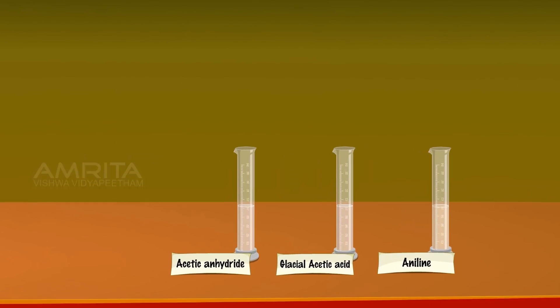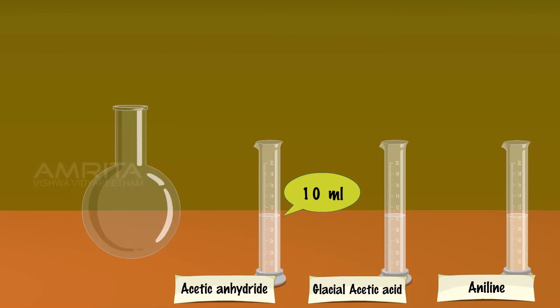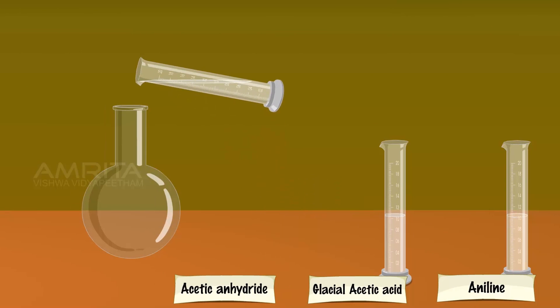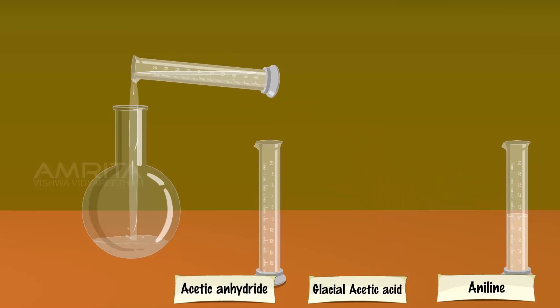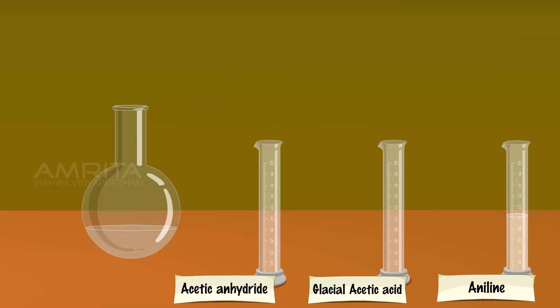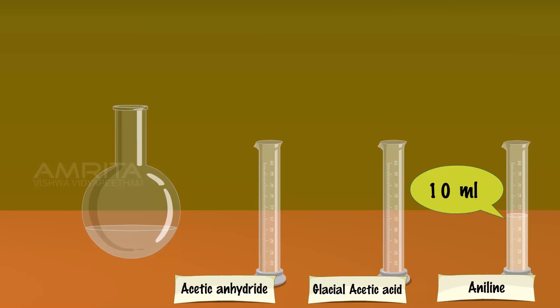In a 250 ml RB flask, take 10 ml Acetic Anhydride and 10 ml Glacial Acetic Acid. Shake the contents of the flask thoroughly and add 10 ml Aniline to this.